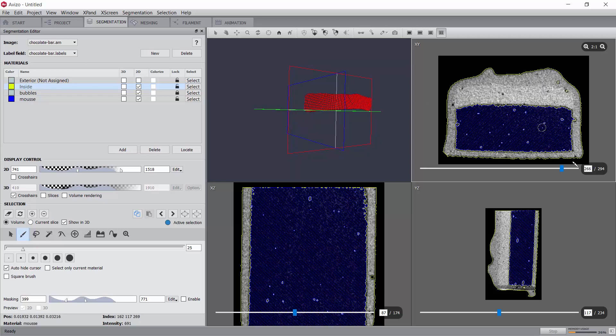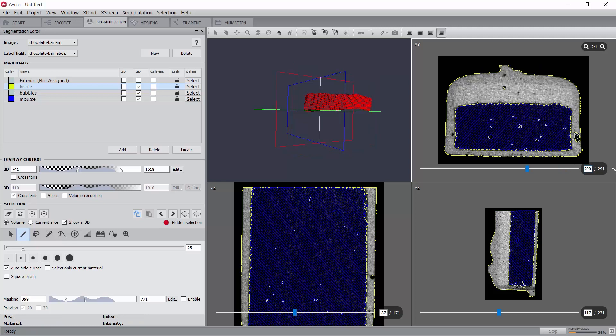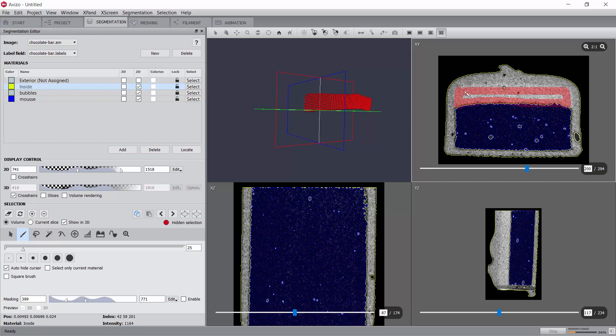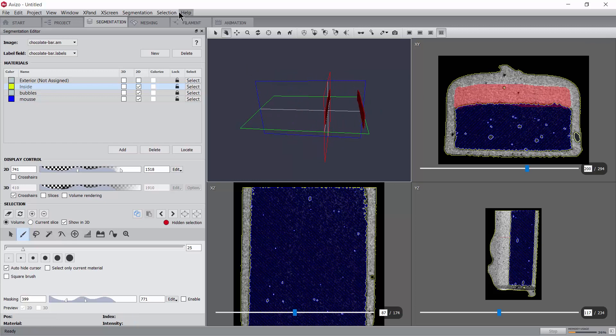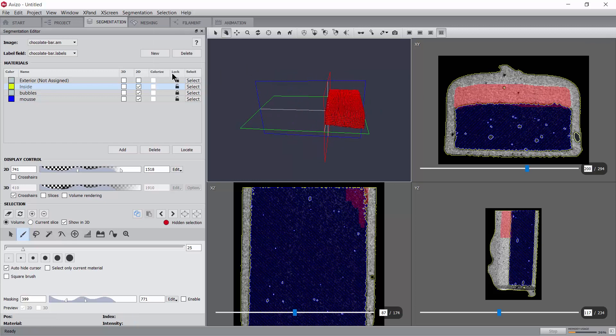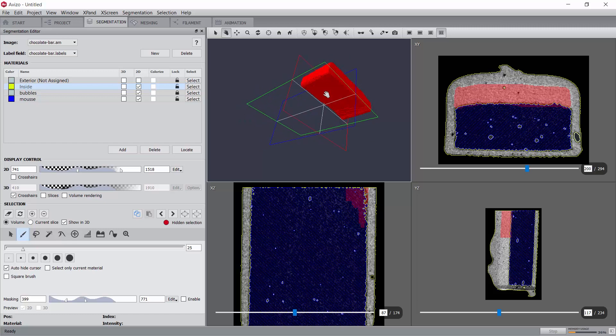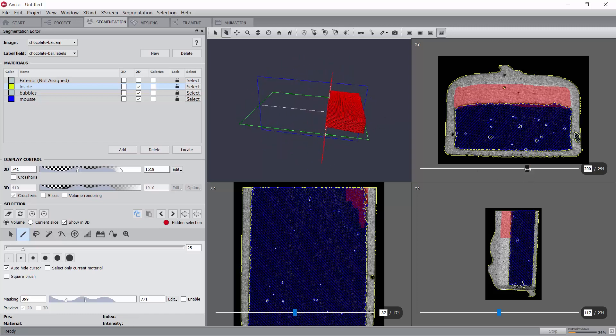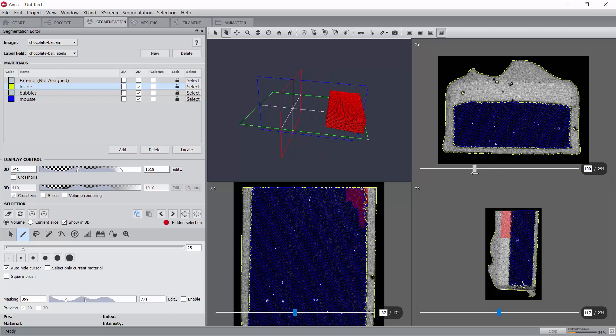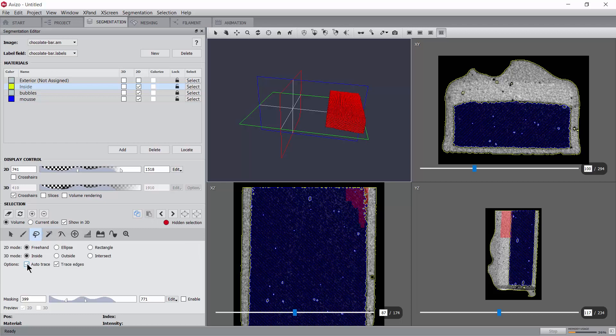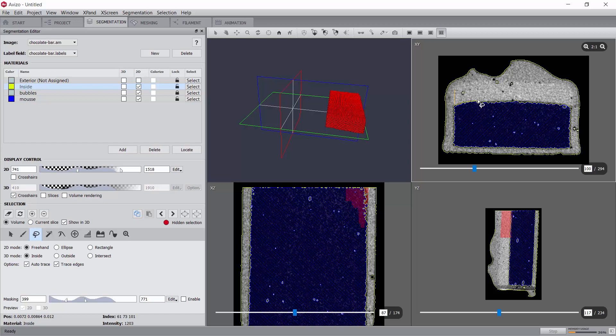Now, let's move to a slice further away, for example slice 200, and select the caramel on that second layer. Now, we can use the menu Selection Interpolate to interpolate the selection between those two slices. Please note that this interpolation operates only on the shape of the selection, and does not take any grayscale information into account. We may use any selection tool for this interpolation process, as long as we use only 2D selection and always in the same 2D viewer.